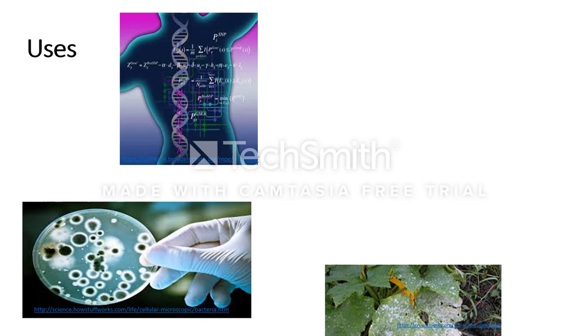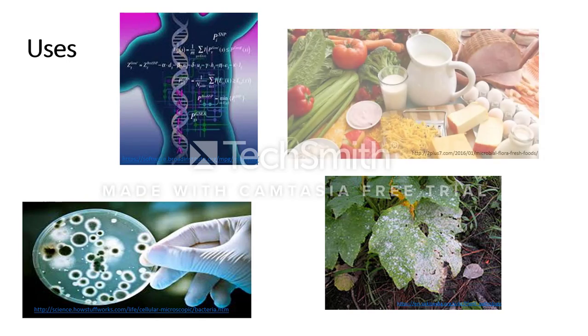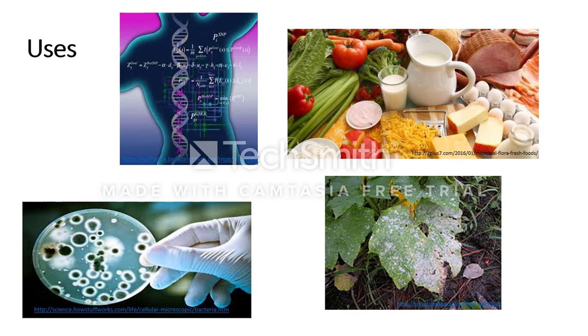Recently, qPCR has also found uses in detecting plant pathogens. Molecular methods are increasingly being used to detect, quantify, and study microbial populations in food or during food processes. Among these methods, PCR-based techniques have been the subject of considerable focus, and ISO guidelines have been established for the detection of foodborne pathogens. qPCR is considered a method of choice for the detection and quantification of microorganisms. One of its major advantages is that it's faster than conventional culture-based methods. It is also highly sensitive and enables simultaneous detection of different microorganisms.